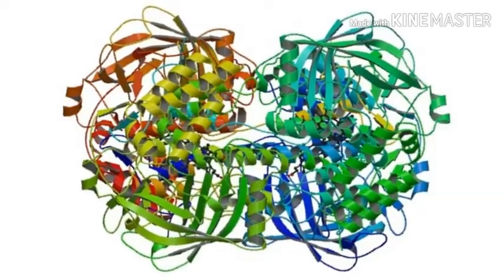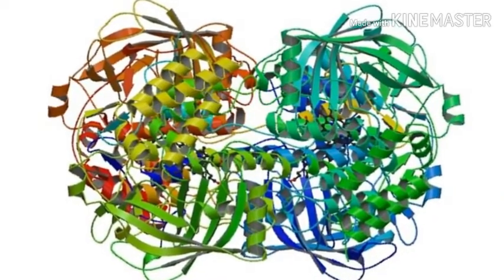Hi everyone, I am Alia from 4 Step 2. Today I'm going to do an experiment for biology subjects. The topic that we are learning now is metabolism and enzymes. In the liver, there is an enzyme called catalase. So today I am going to do an experiment about the catalase enzyme.